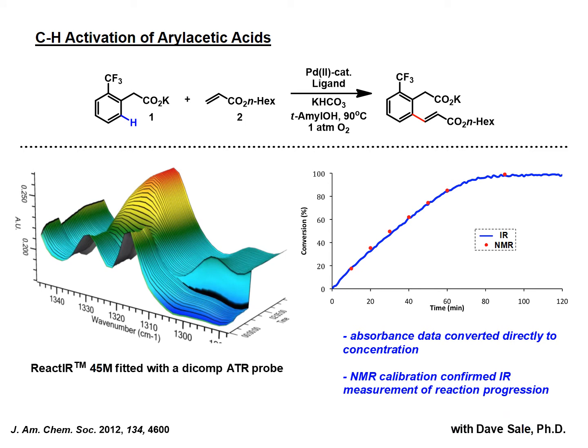I got my absorbance values, and I will admit we did do ex situ correlation to the in situ data, but I would still argue you don't have to do that. It's not necessary. And I've never once done this where it hasn't matched. Never once. But you can do that. The reviewers like to see it. It helps them sleep at night. So the reaction is doing what we say it's doing, right?